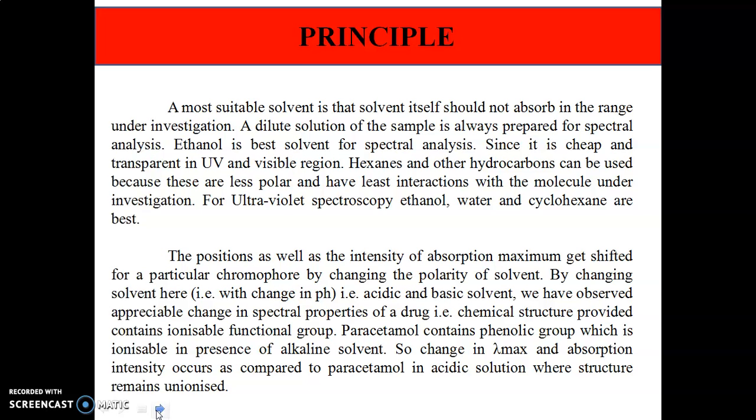The position as well as the intensity of the absorption maximum gets shifted for a particular chromophore by changing the polarity of the solvent. By changing the solvent, that is, with a change in pH, whether acidic or basic, we observe an appreciable change in the spectral properties of the drug, provided the chemical structure contains an ionizable functional group.